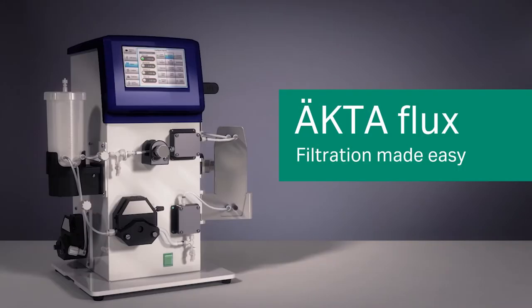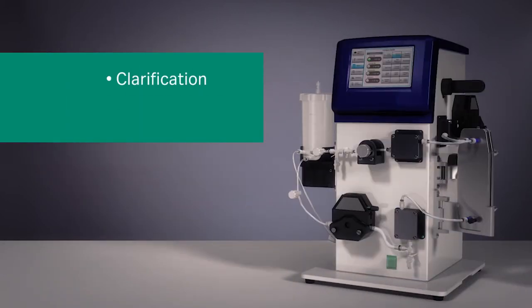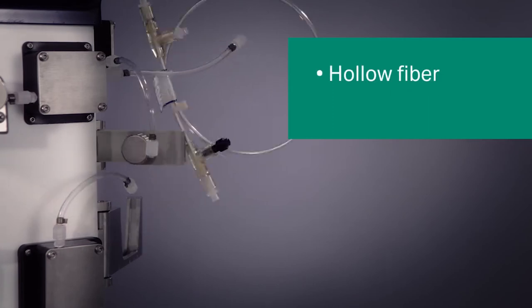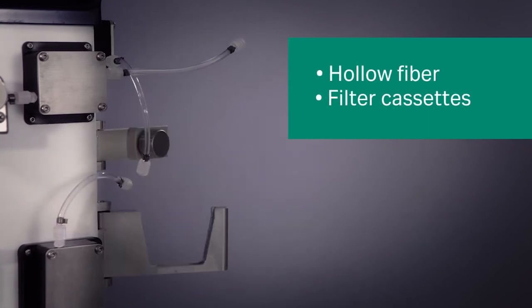ÄKTA flux is an easy-to-use cross-flow filtration system suitable for a wide range of applications such as clarification, concentration, and diafiltration. The system can handle a variety of cross-flow filters, both hollow fiber cartridges and filter cassettes in the ultra and micro filtration ranges.